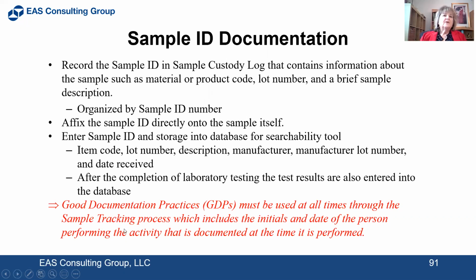Good documentation practices must be used at all times through the sample tracking process, which includes the initials and date of the person performing the activity that is documented at the time that it is performed.